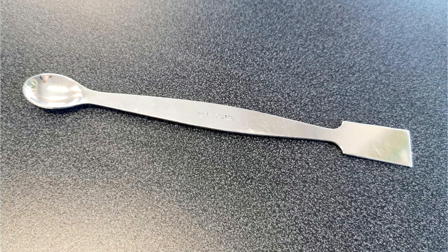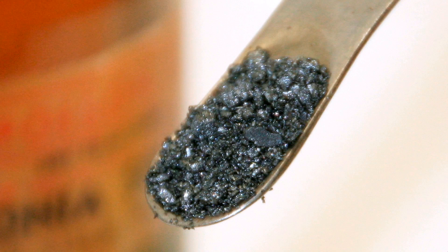Here we have a metal spatula — flat on one end and scooped on the other like a little spoon. You can scoop up some chemicals to move them from one container to another. In this case, this is iodine crystals.